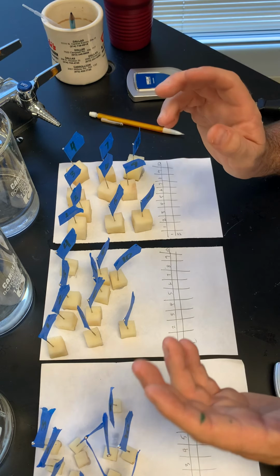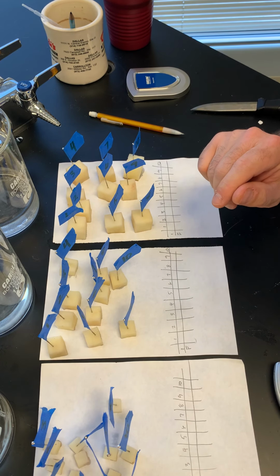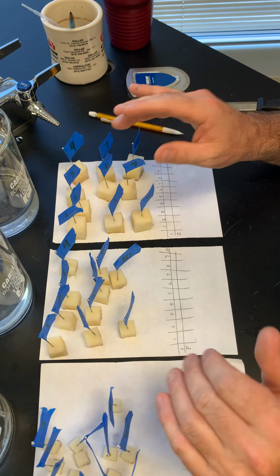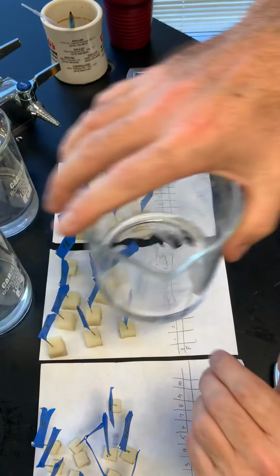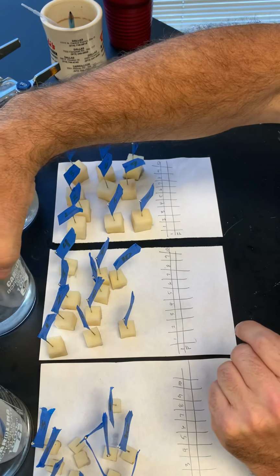Now, you don't have to choose surface area to volume ratio. There are 2 other factors that can affect the rate of osmosis. You'll have to control for surface area to volume if you choose another variable. Say it's concentration gradient. Instead, these are all going to be in just pure water. These are beakers with 100% water. This is distilled water. It's 100% water.